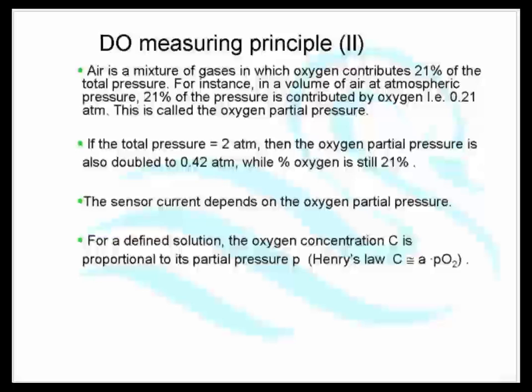It's every bit as reliable, and it needs every bit as much calibrating. That's the first method, and despite my sarcasm, you might have noted I don't like these type of probes. They are oversensitive, and they're just a pain.